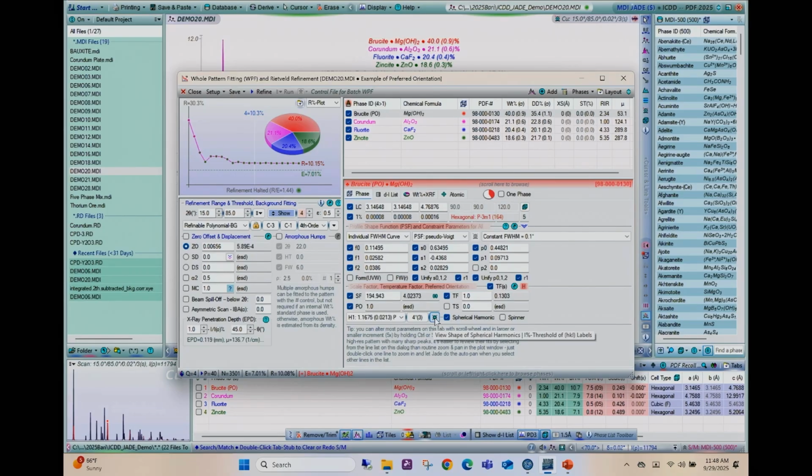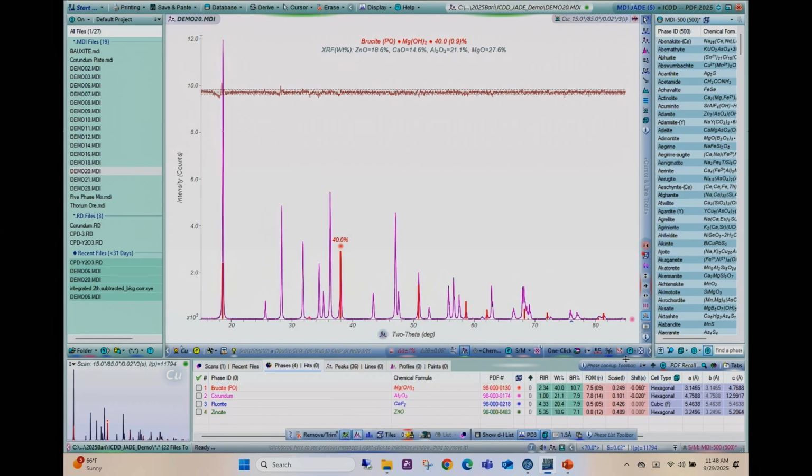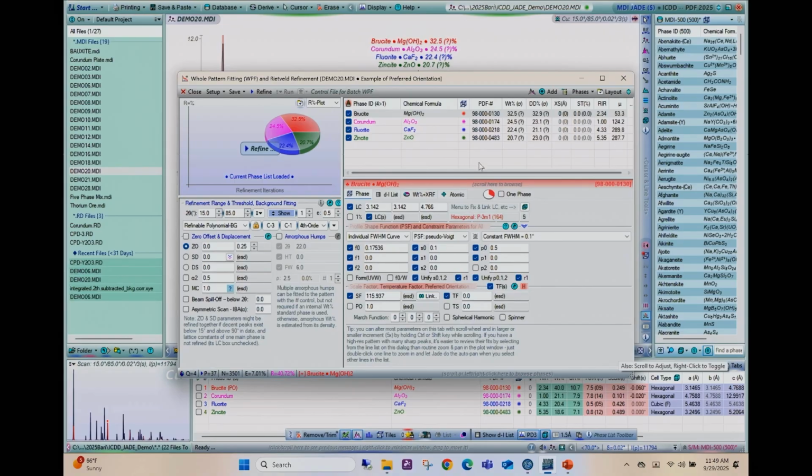Can you just show them? Yes. So basically, what you would do is click on the little icon here, and when you open it up, that's how you would see the data that's been gone through in terms of this first refinement.